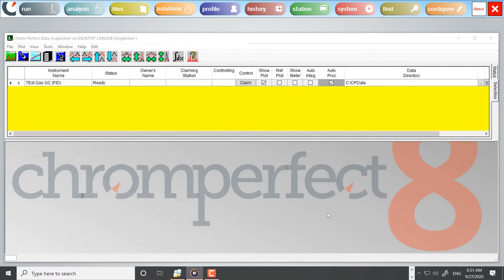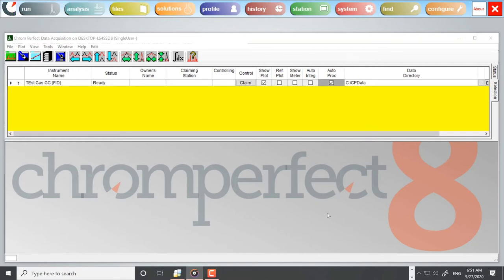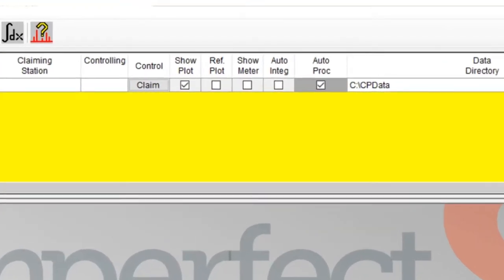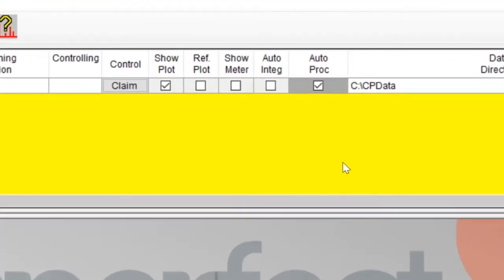There is a common misconception that deselecting the AutoProc tick box within the Run program will switch off printing of reports. Although this is partially true, it also prevents ChromePerfect from performing other important processing tasks.